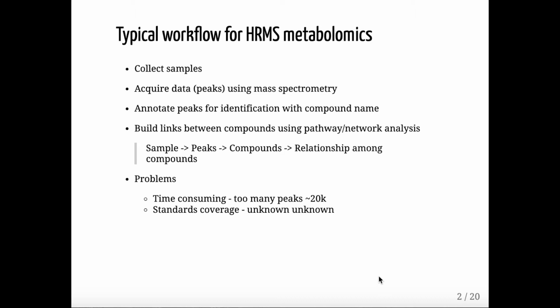There are two problems with this typical workflow. The first one is that it is time consuming. Usually for each sample, we can collect more than 20,000 peaks or features. There are too many peaks. If we want to check them one by one, it's almost impossible. Another problem is the standard coverage. When we want to make identifications from peaks to compounds, we all rely on some known database, or some prediction algorithm based on a known database. So in this case, it's really hard to find unknown compounds.